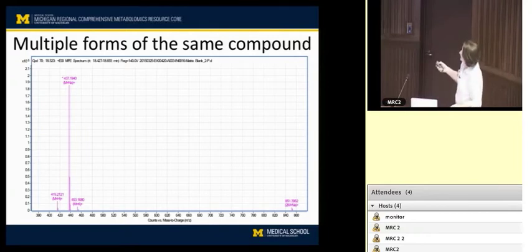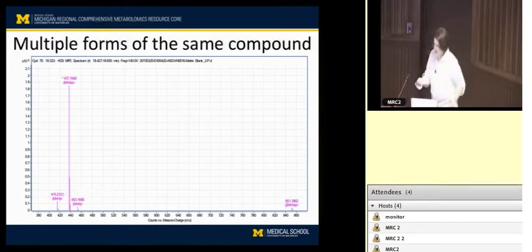So in a different sample, it might call this and this two different things. And the recursive search will be able to go back and say, if this is what it called in 80% of the samples, but it's not finding it the second time around, it can go back and say, oh, it was really there, but we collapsed it into this feature, and we didn't collapse it into that feature, in another sample.